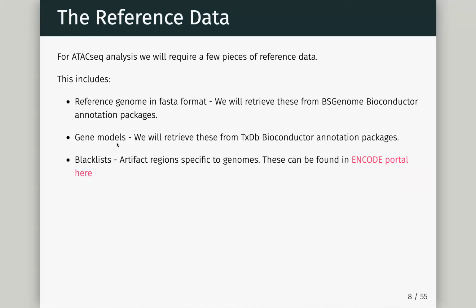Actually, it turns out from our work and other people's work that this is basically to do with repeat expansion. It's because your genome's got bigger than you think it is. If a region which you think is 100 base pairs long is actually 100,000 base pairs long, when you go to get a random sampling of reads over that region, randomly sampling over 100, you're not going to get many reads. Over 100,000, by chance, you get a lot of reads. Then when we realigned it back to the genome we understand, we end up with this tiny region, 100 base pairs, which is probably repeated 1,000 times in the genome. We map to that one region and we just get a pile up of reads.